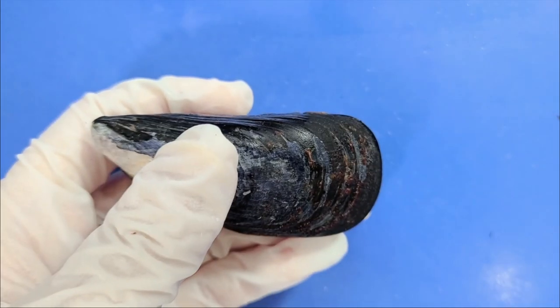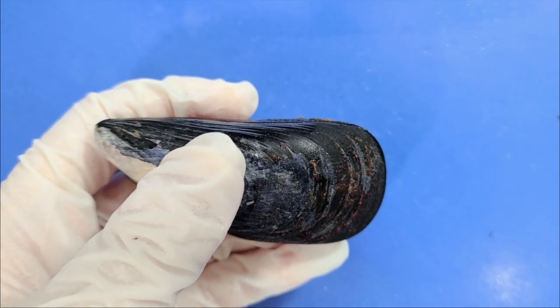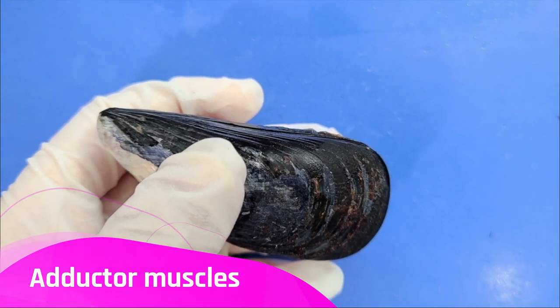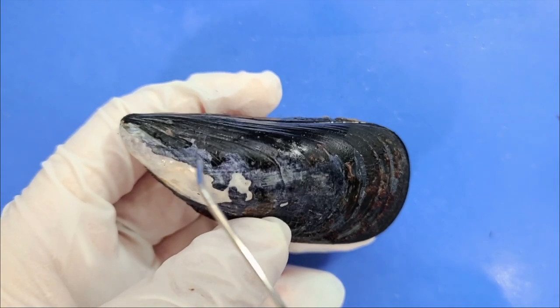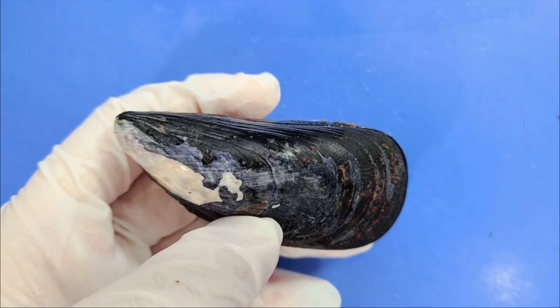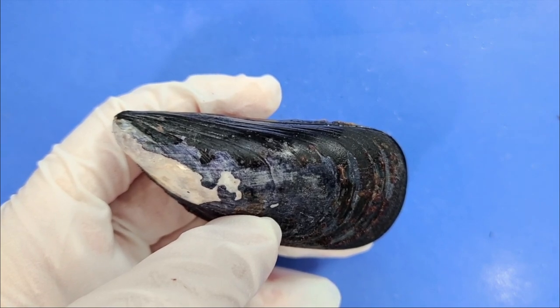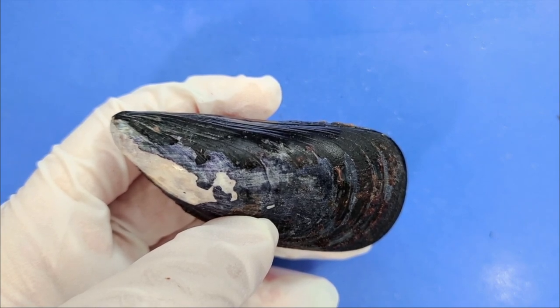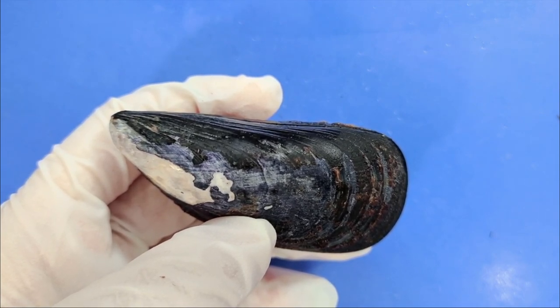Now I'm going to pry open the mussel, and for that I'll have to cut through some tough muscles called adductor muscles. Mussels have two of these, one on each side. Adductor muscles allow mussels to open and close their shells. Mussels typically close their shells tightly when they are exposed to air, low water levels, or predators.